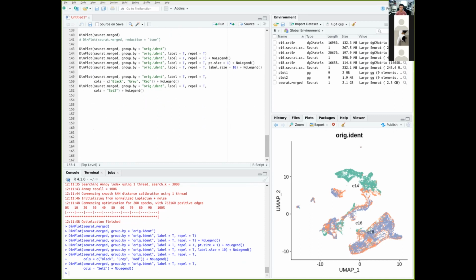The next one is a bit advanced, so I'm not going to explain the code. I'm going to tell you what it does. It's quite cool actually, but the code itself is a little bit complex because I use data frame subsetting to basically highlight certain cells.